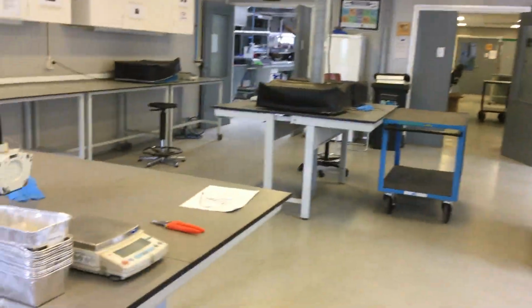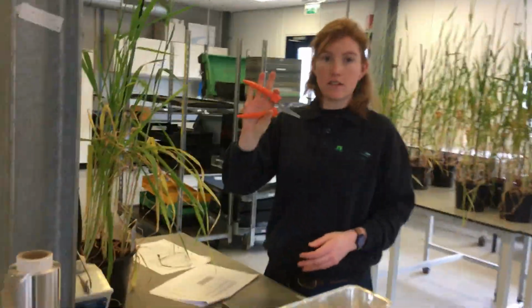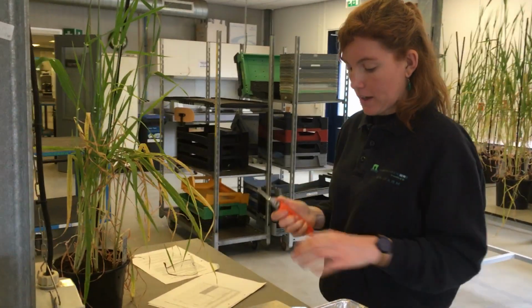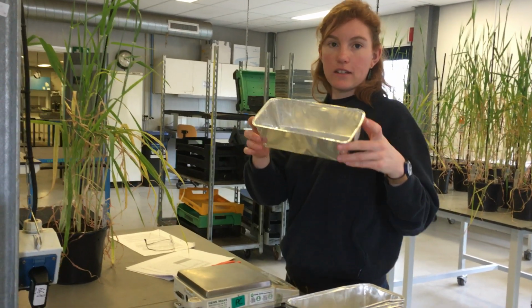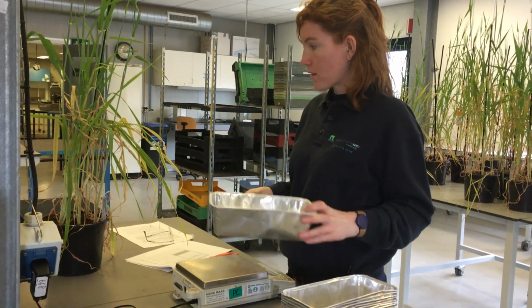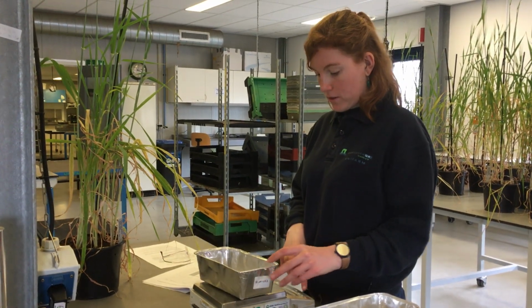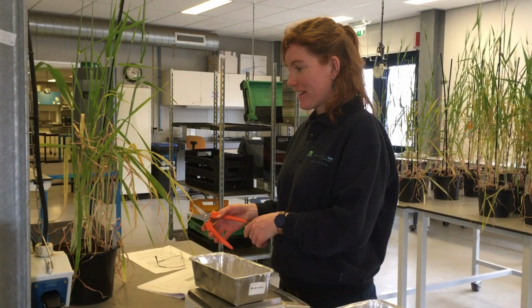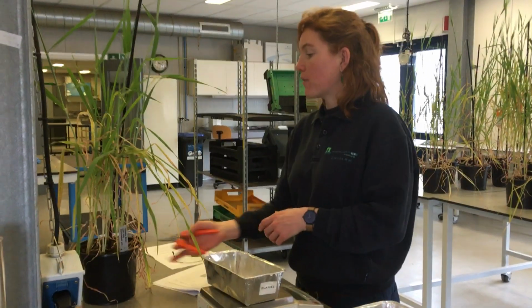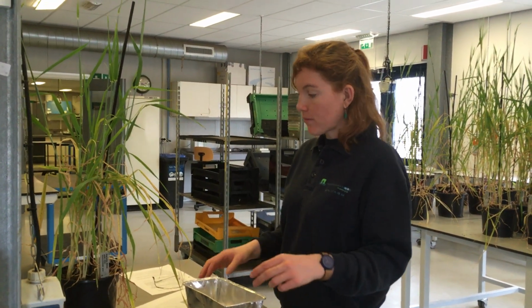Could you take one pot to show the fresh weight? Sure. And here is our equipment. So I have a pair of scissors and a scale and a whole bunch of these tins. What we're going to do is weigh the tin, put the scale to 0. That's very important. Otherwise, they are included as fresh weight. Then cut one plant off at soil level, put it in the tin, and measure the fresh weight.